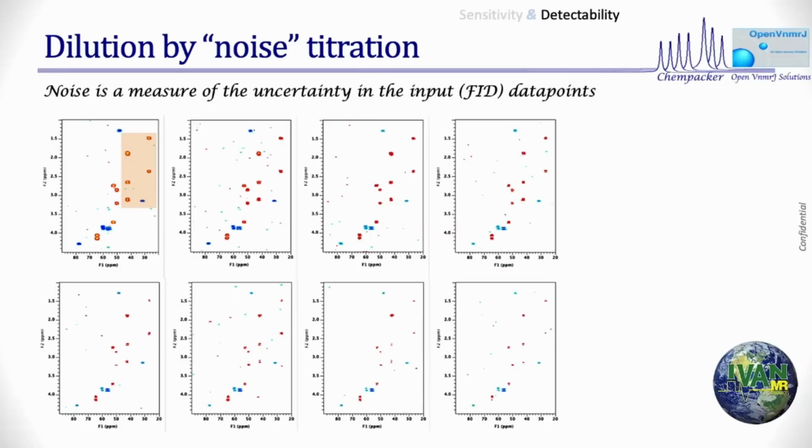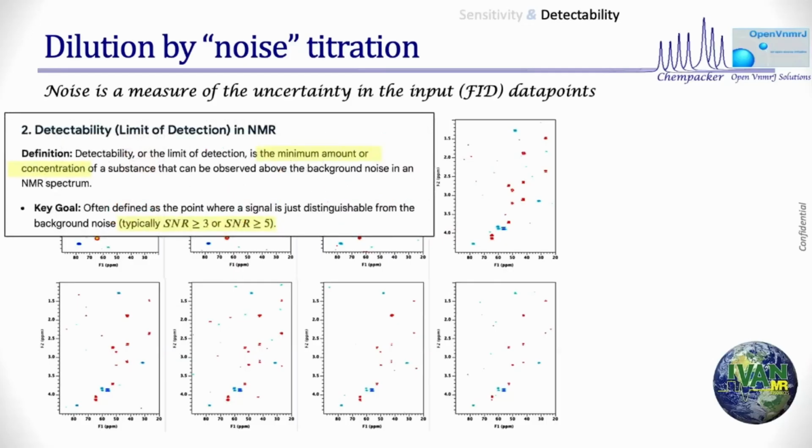It's a lot faster. 3 seconds. Make noise, it takes you 3 seconds. Maybe I'm not doing it right. 3 seconds, that's it. Dilution. I just did a dilution, an 8 times dilution. 8 data sets I have. I now want a benchmark. A sensitivity-based benchmark. How low can I go?